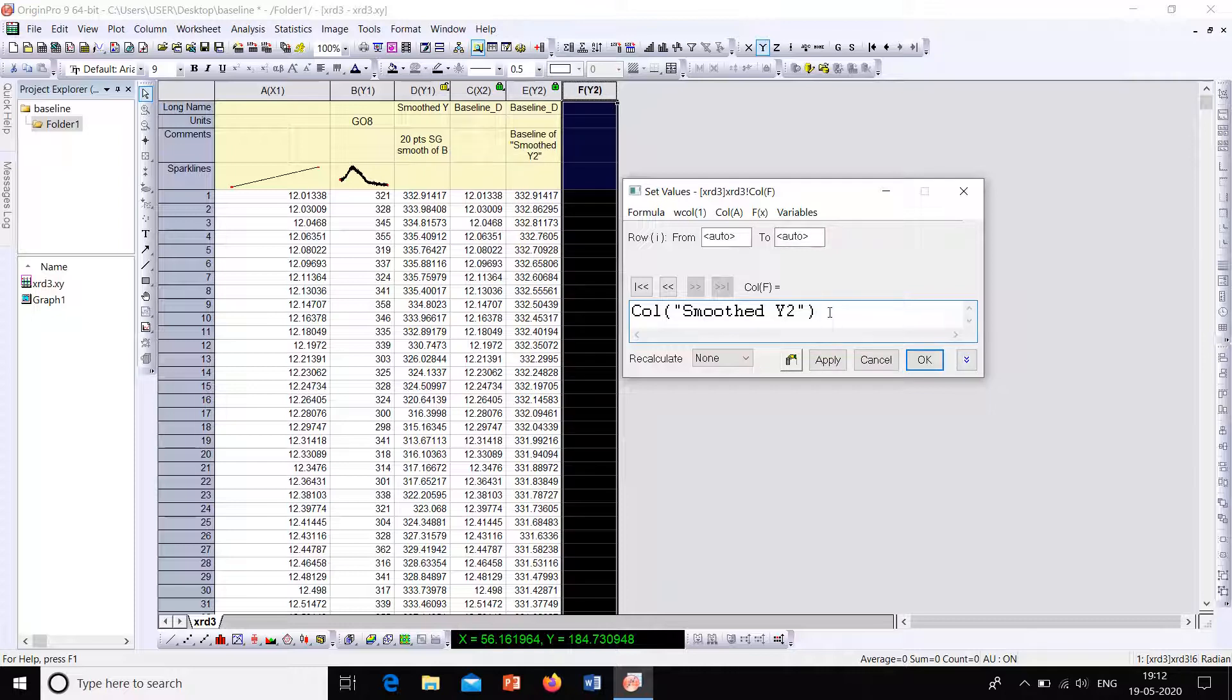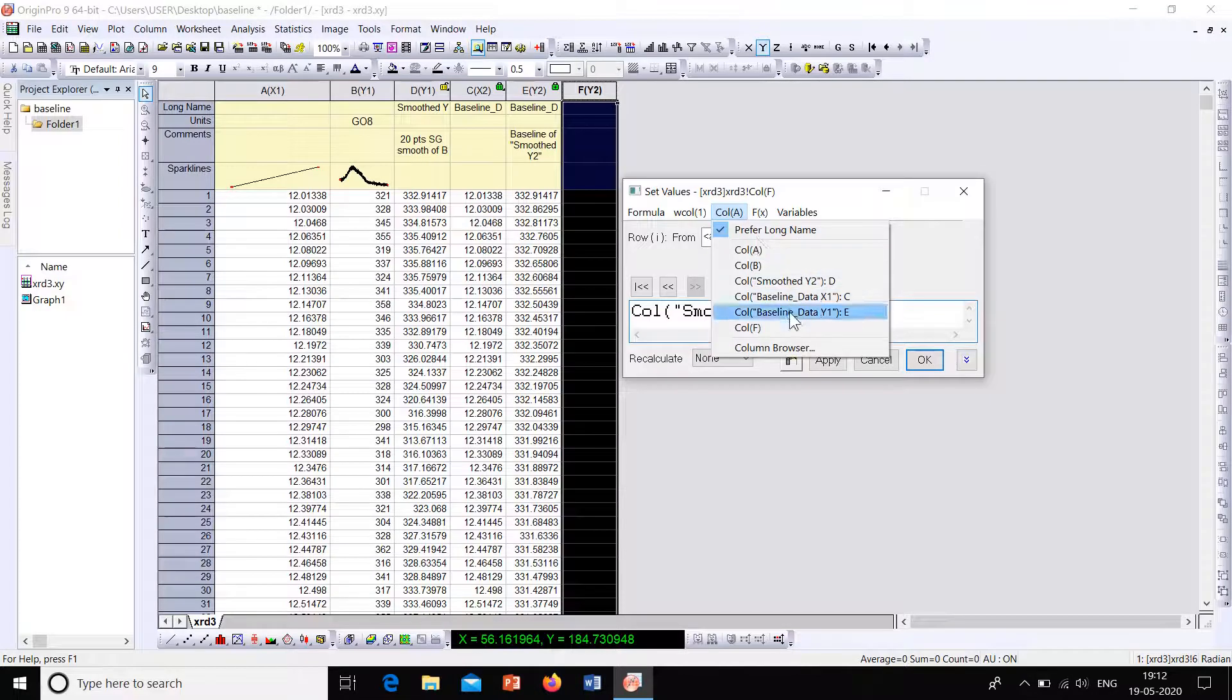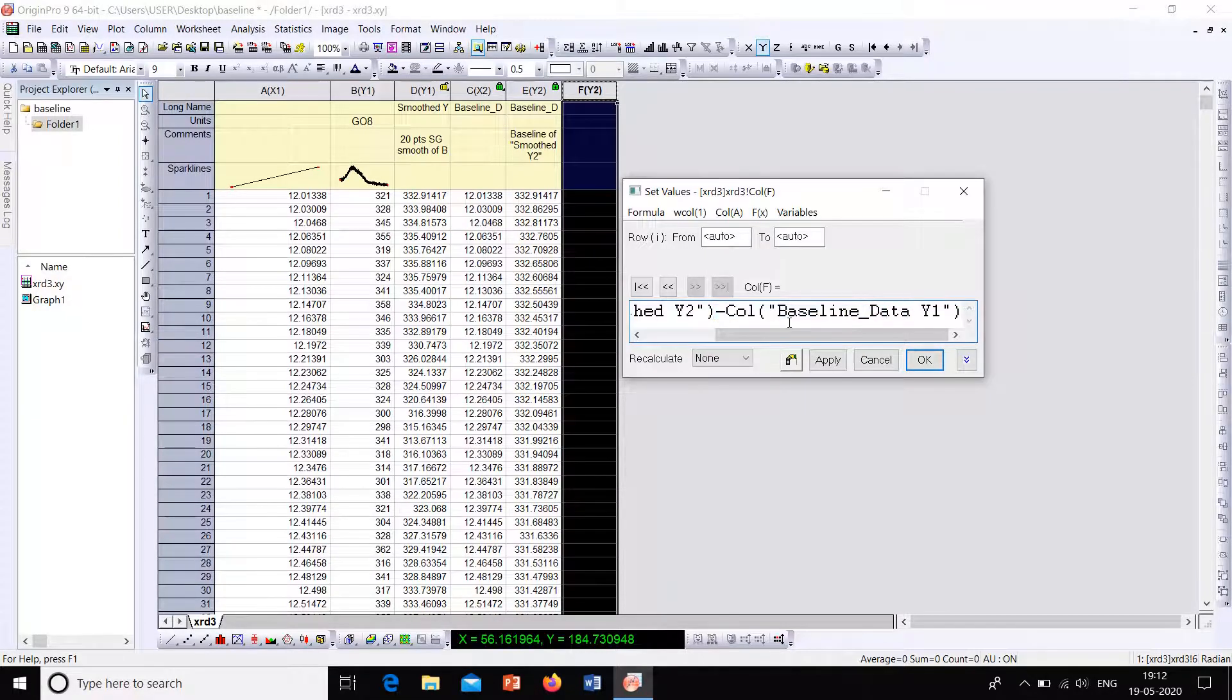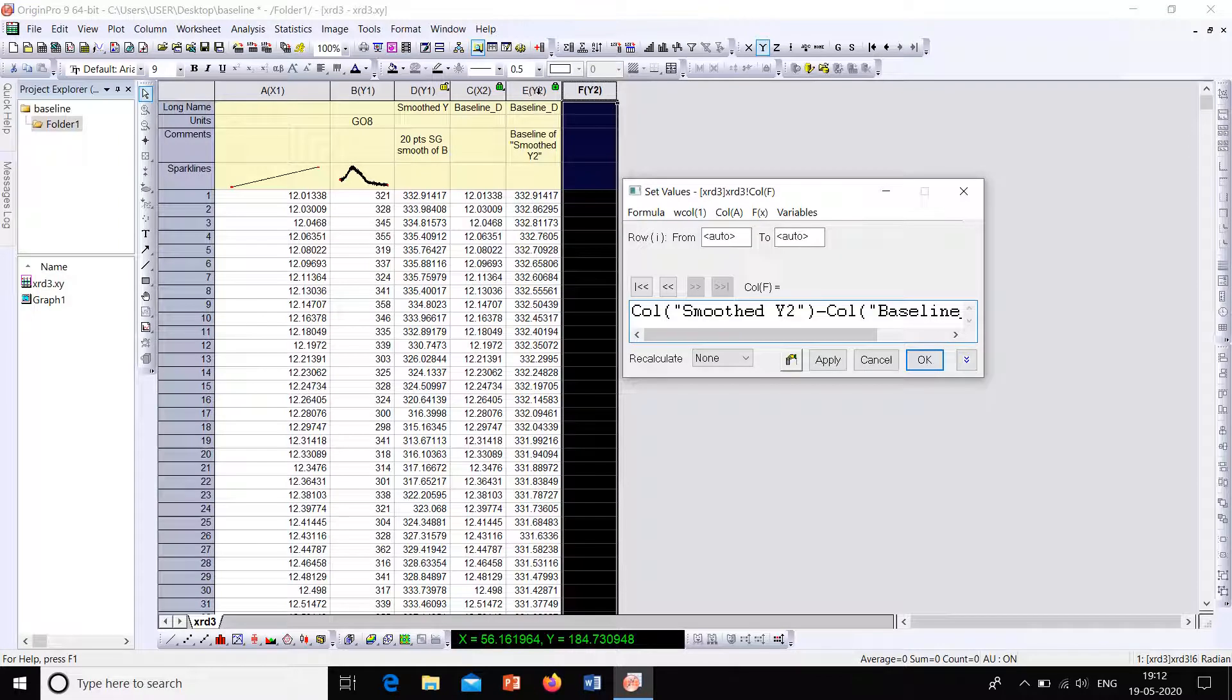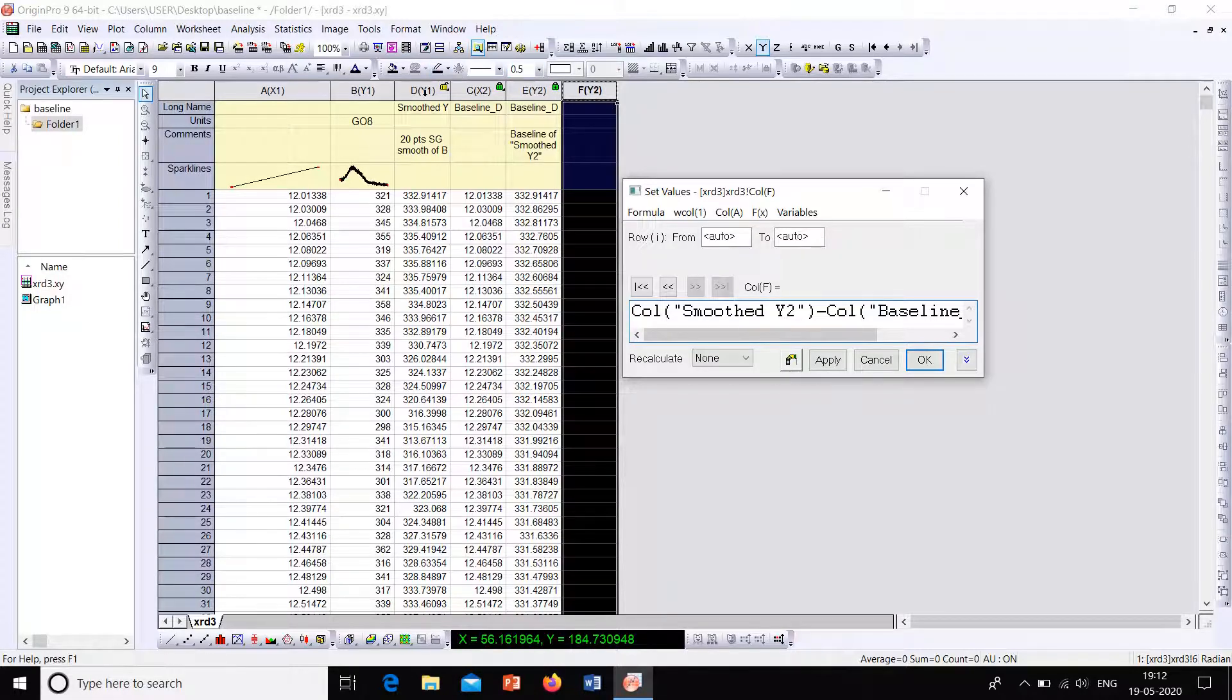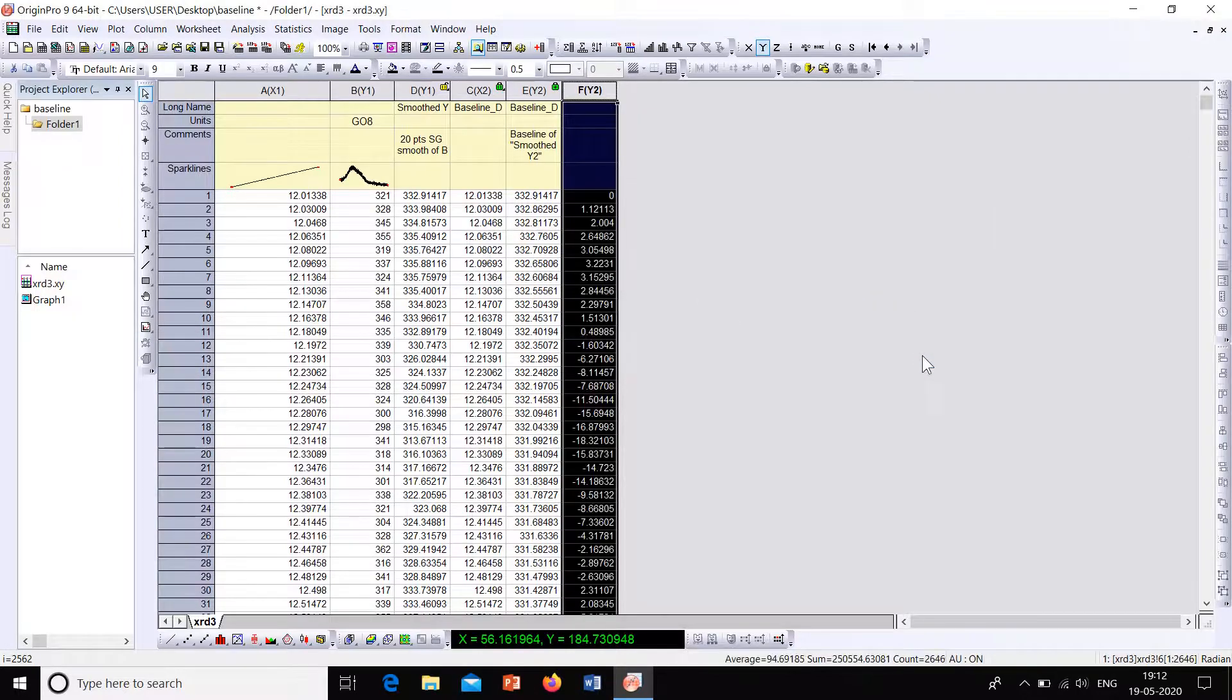So this is the Column D. Now from the keyboard, enter minus sign. Then select Column A again and select E. So this dialog shows that we are subtracting Column D from Column E. So I mean Smoothed Y minus Baseline. So now click onto OK.